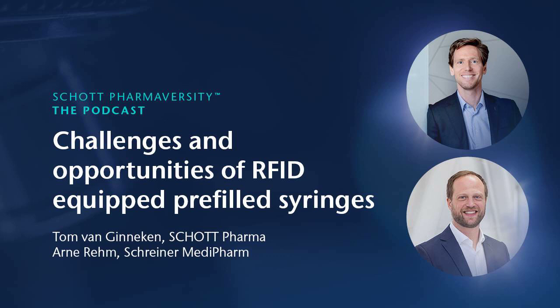The topic of today is all about making syringes smart. And we will actually be talking about how to equip a PFS with RFID, why you might want to do this, and what it means for the pharma filling processes.